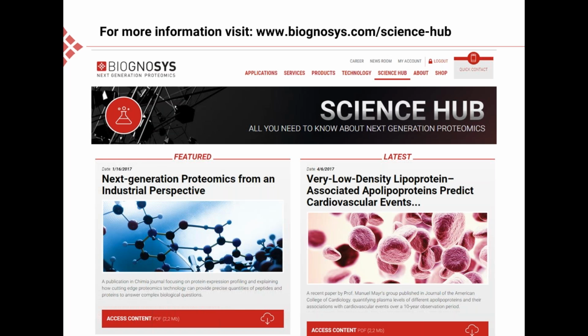And when the IRT peptides are not in the sample, then the software has only the fallback option to go to the extensive IRT concept. And for some samples, this extensive IRT calibration set is actually not optimized, and therefore leads to results that are not desired. Therefore, we always highly recommend to use the IRT peptides or the HRM peptides for the generation of spectral libraries.